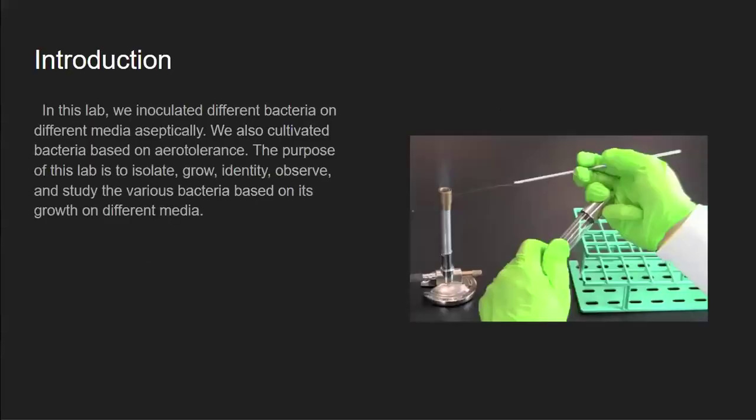Introduction. In this lab, we inoculated different bacteria on different media aseptically. We also cultivated bacteria based on aerotolerance. The purpose of this lab is to isolate, grow, identify, observe, and study the various bacteria based on their growth on different media.